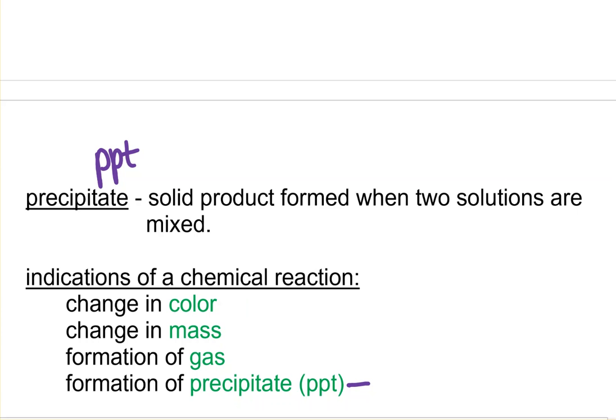If something bubbles without heating it, it tells you that probably a gaseous product is formed and you have a chemical reaction.